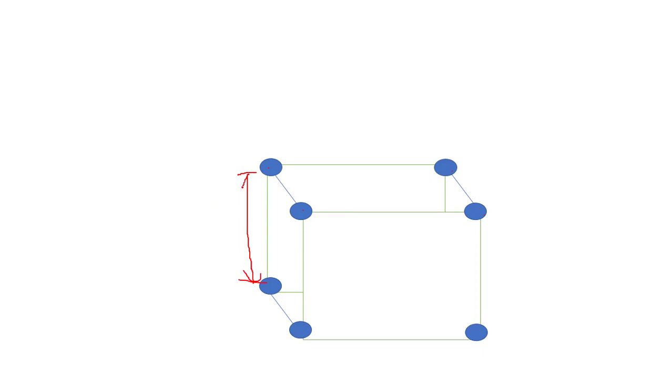So our intention with X-ray diffraction is to find this distance. If we know this distance, we can arrange our atoms in the crystal lattice structure. Now how can we find that?